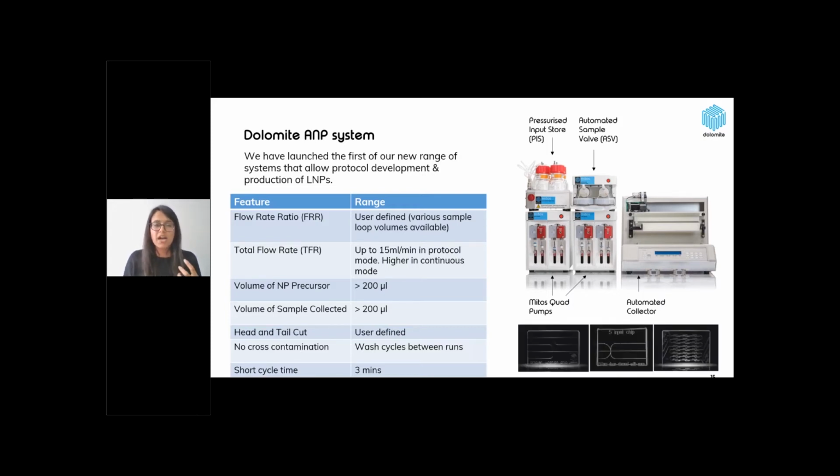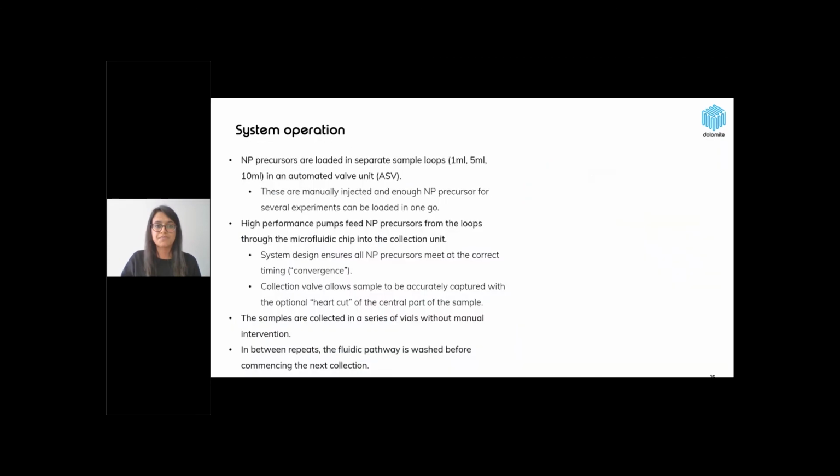With microfluidic chips, you have a range of different options available. All of these essentially are designed to create nanoparticles. So they have pros and cons for various different parameters, but essentially you can use any of these chips that are available to you to produce lipid nanoparticles.